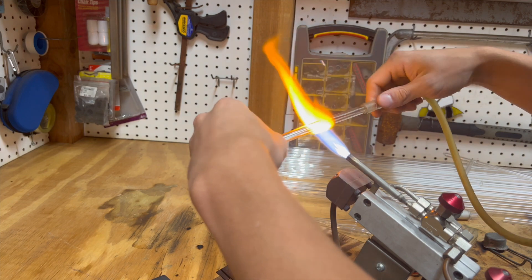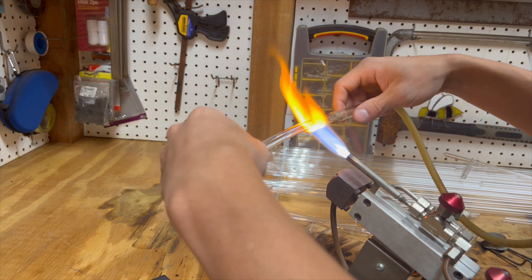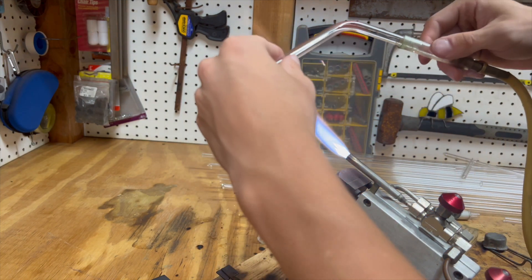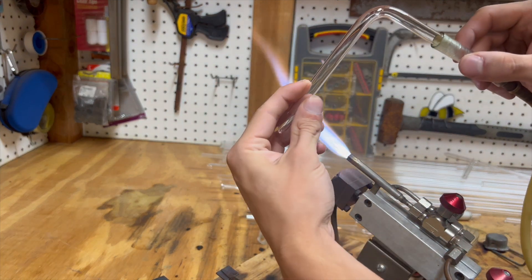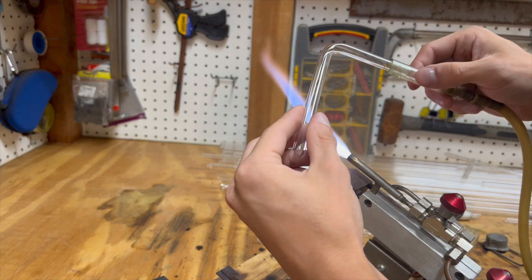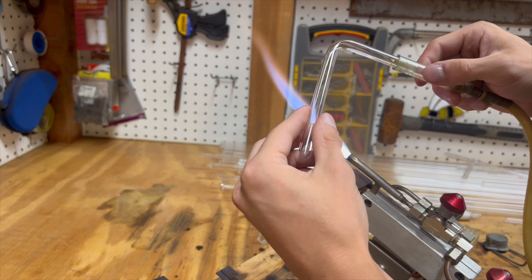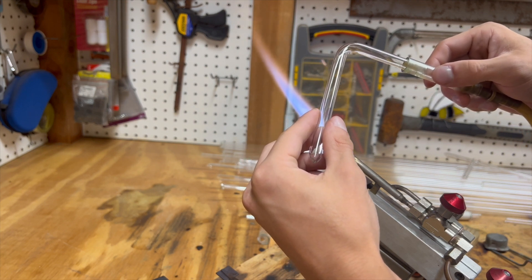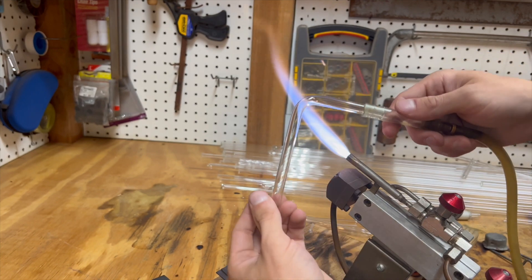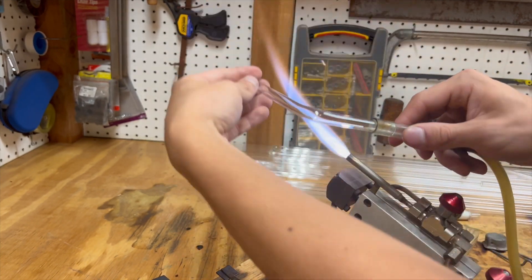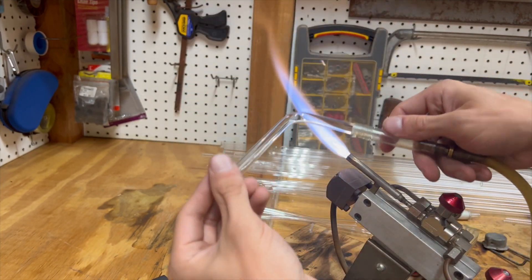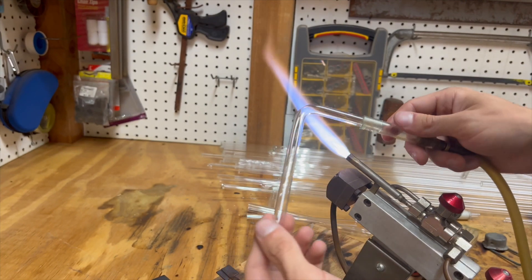Once you have enough heat in there, then you're going to take it away out of the flame and bend it. And while you're bending it, you want to blow into the blow hose assembly to apply pressure inside. If you don't do this, it will kink and mess up your bend. And there you have it. Your tube's done. And it's a quite quick and simple process.